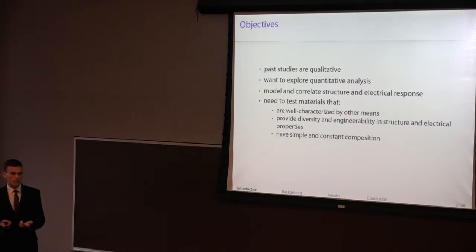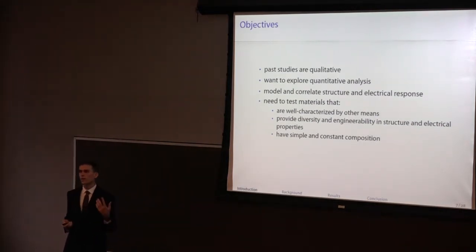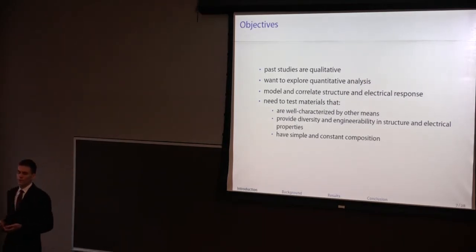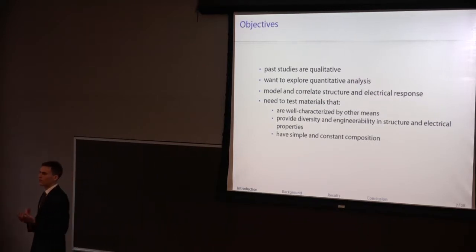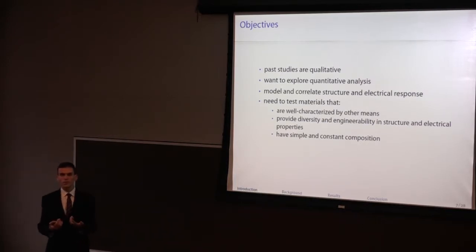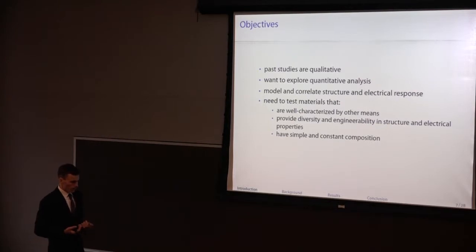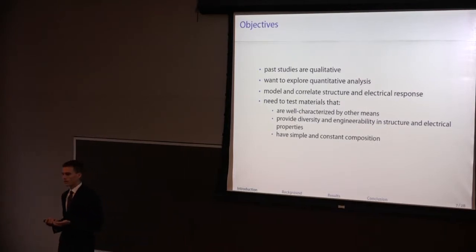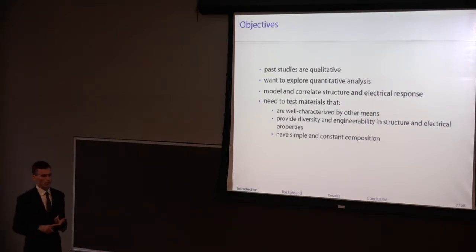But what am I going to do with it? I had said that it's a contrast technique, and actually all these past studies are qualitative in nature. I'm interested in exploring quantitative analysis with this technique, and more specifically trying to correlate the structure of heterogeneous materials with their electrical function, their electrical behavior. So in order to do something like that, we have to be careful with our choice of material.